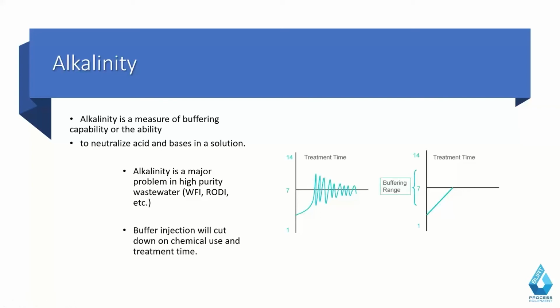What we're talking about is a significant portion of high purity water, not a little bit of deionized water like you may have in some lab-based spaces, but you're dumping a lot of it down the drain in concert with just raw waste at that point. You do need to take into account this alkalinity concern in those cases.